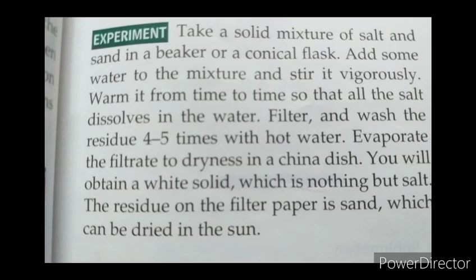Take a solid mixture of salt and sand in a beaker, and we will add some water to the mixture and stir it. And then we will warm it from time to time so that all the salt gets dissolved in the water. Then we will filter and wash the residue 4 to 5 times with hot water.